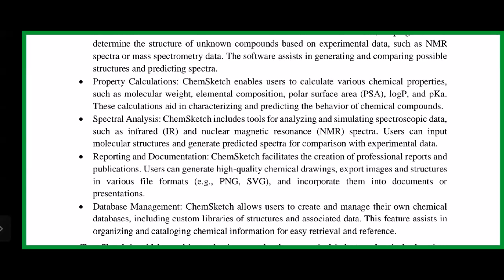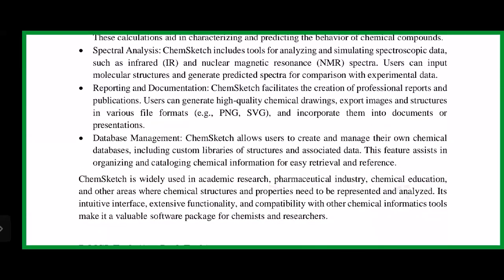So they say, go and bring me that particular, what is it called now? In the chemistry language, is it profile or chromatogram or whatever? Spectra, okay, they call it spectra, and they will start interpreting. So these tools you can use to predict how the actual spectra of your compound will look. By the time you use your infrared spectroscopy or NMR to get the spectra, you can compare, so you have insight into what you are expecting in real life. That is the thing that you can do with this ChemSketch.